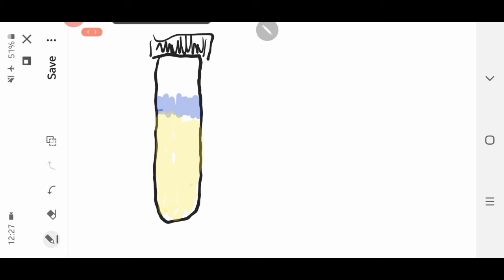So let's say we inoculate our tube, we let it grow for a period of time, and we come back, and all the growth is down here at the bottom. There's just a little pellet of growth down there at the bottom. What is that telling you about the requirements or needs for that organism? Or conversely, what if we have growth just up here at the top, like a little floating ring? What would that tell you about its growth? If that organism is growing up there, you're probably not going to see that blue up there. So think about that, and make your predictions of what you would expect to see.